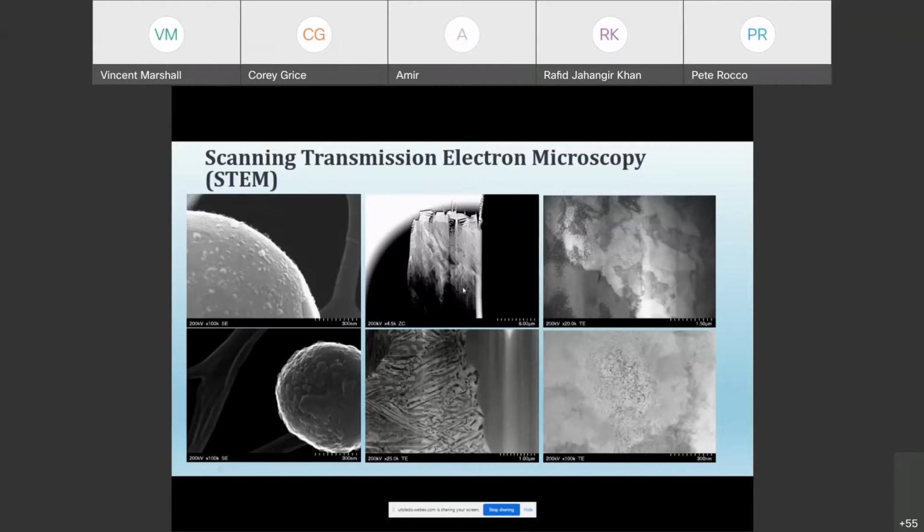You've got regions of differing phase composition there, and almost like a dendrite or root system going through there. This is an example of that previous metal sample that had the different regions of phases. So you can see on the right, it's very homogeneous. You don't see any significant differences in there.